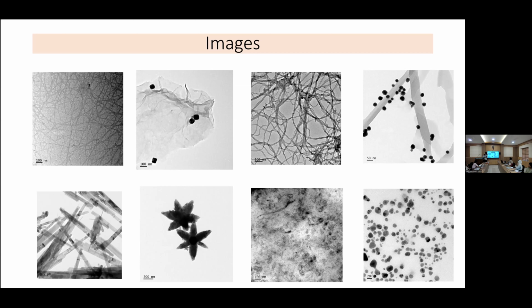This is a cellulose nanofiber image. This is graphene decorated with some Ag cubes. And this is a carbon nanotube. This is some Ag silver particles adsorbed on some other drug material. And those two are zinc oxide. This is a zinc oxide rod and this is a zinc oxide flower. And then these are polymer nanocomposites, because in the tire industry they are using carbon black in a rubber matrix. Like that, in this sample, they placed carbon black.